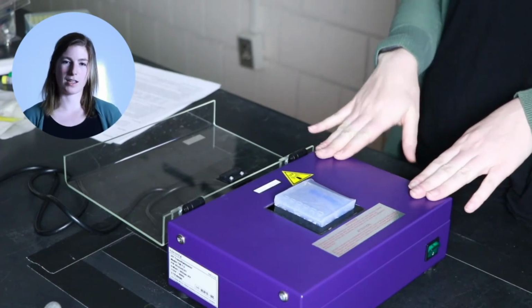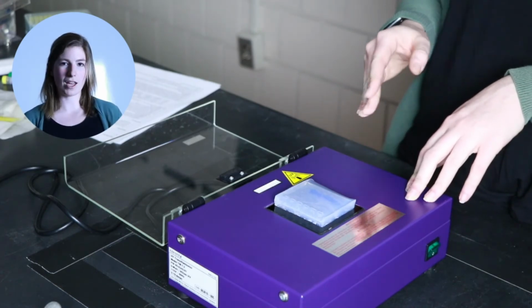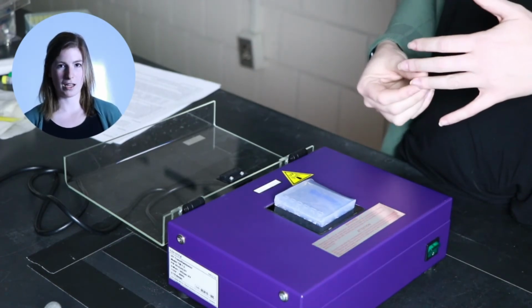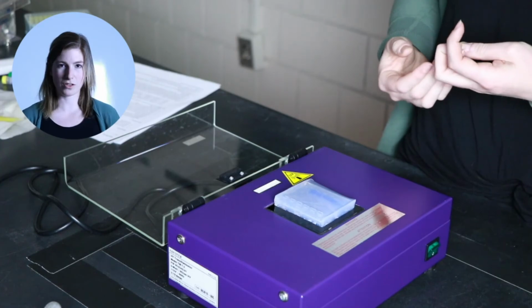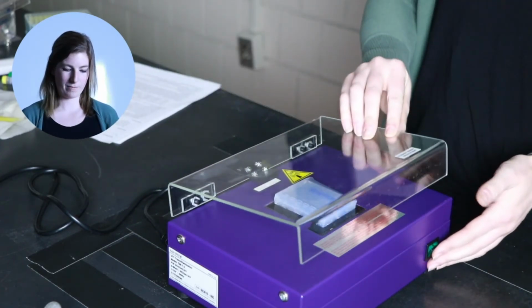So now what I'm going to do is I have this on a UV light box, and we're going to actually turn this on, and when we do that, we'll be able to see the different bands show up, and we'll be able to see our results. So we're going to turn some of the lights off, and we'll show you what it looks like.